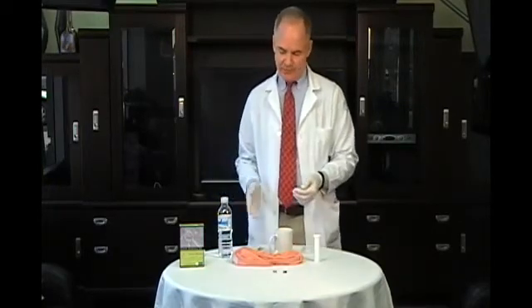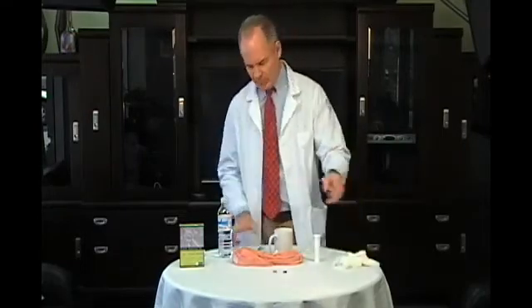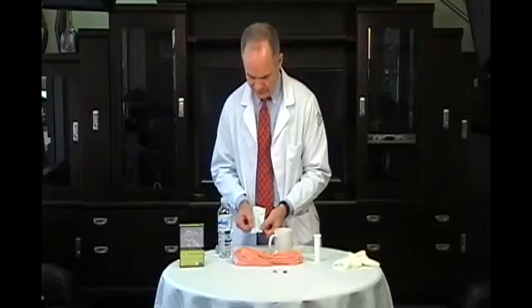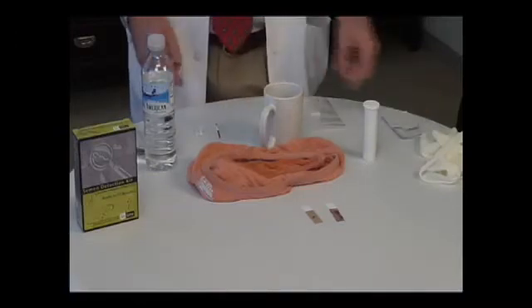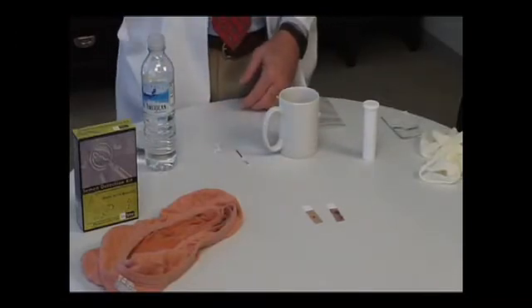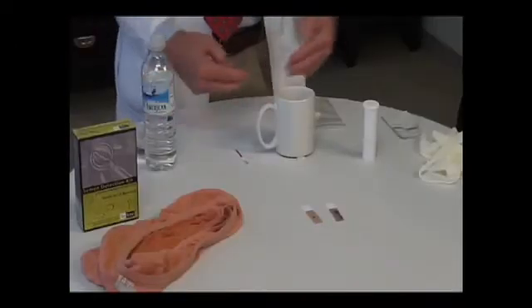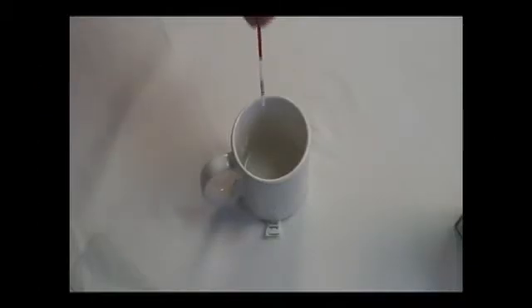Now what we're going to do is put a PSA test strip inside the coffee cup. Take a pouch, open it, put it out. Inside this pouch you'll find a PSA test strip and a desiccant packet. The procedure is simply to take the test strip and put it in the coffee cup. What I like to do is tilt the cup slightly and put this desiccant packet under it as a convenient way of moving the water to one side so it'll be deep enough. Take the test strip and place it in the cup.